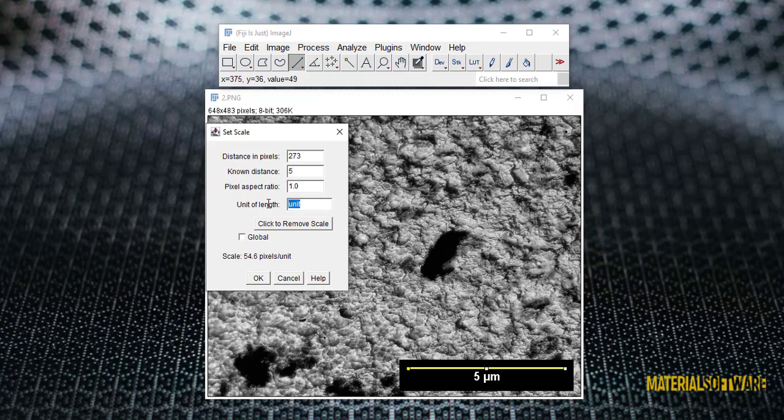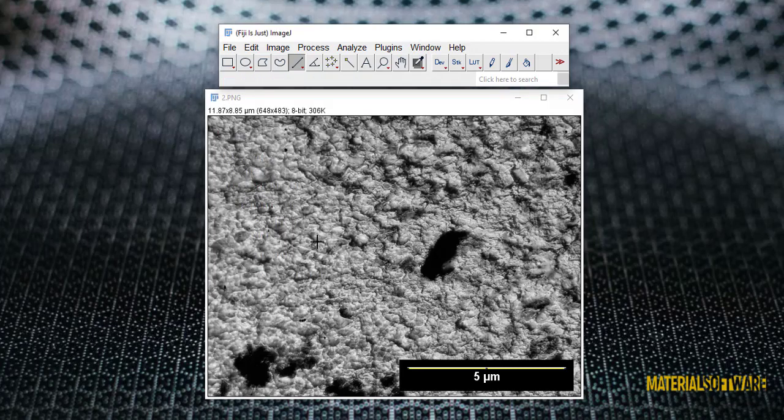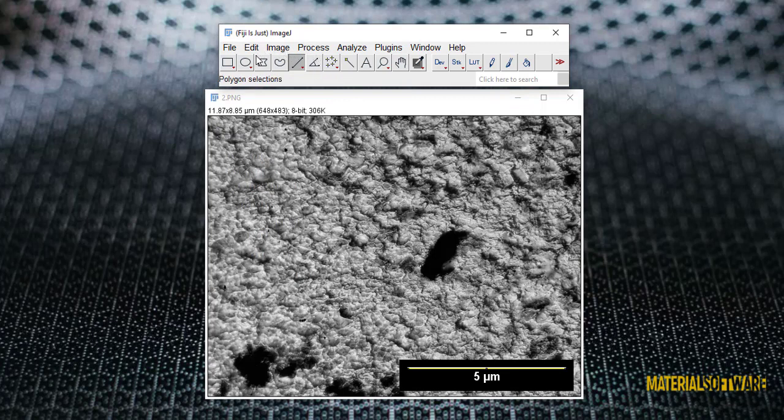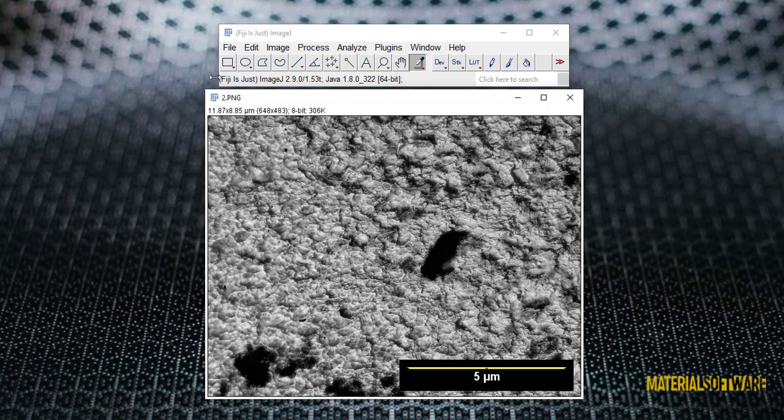Now we have to clear the scale line so that it does not cause errors in the final calculation. For this, we select this option and select an area of the sample background so that the color of the software becomes the color of the background.